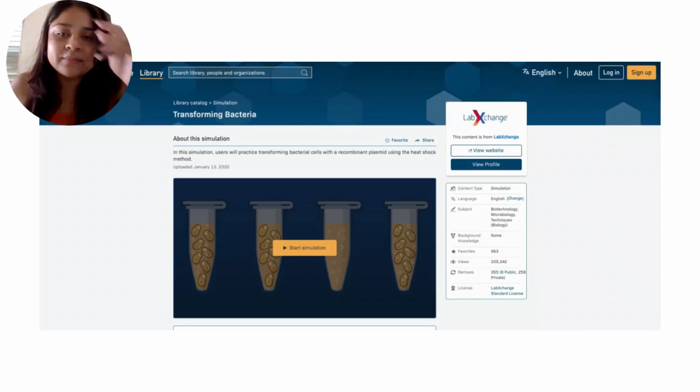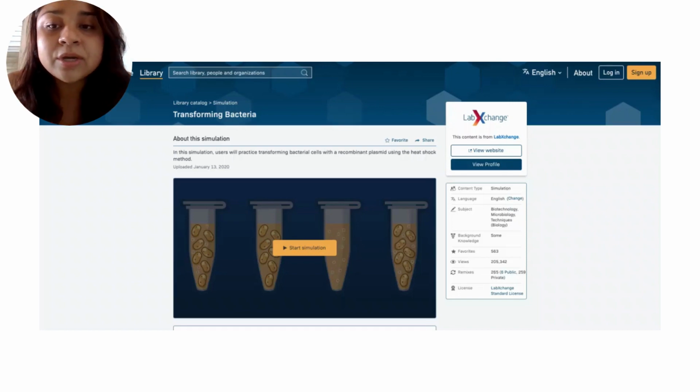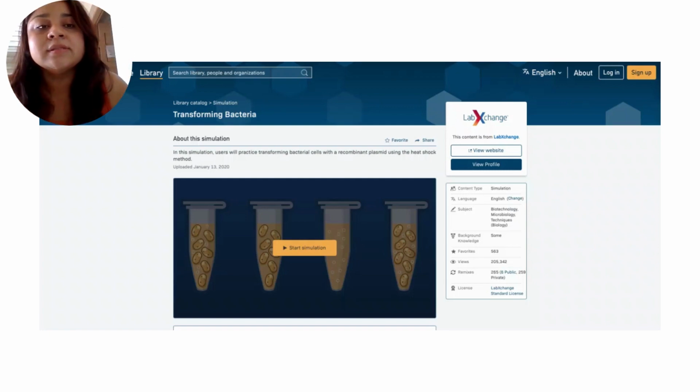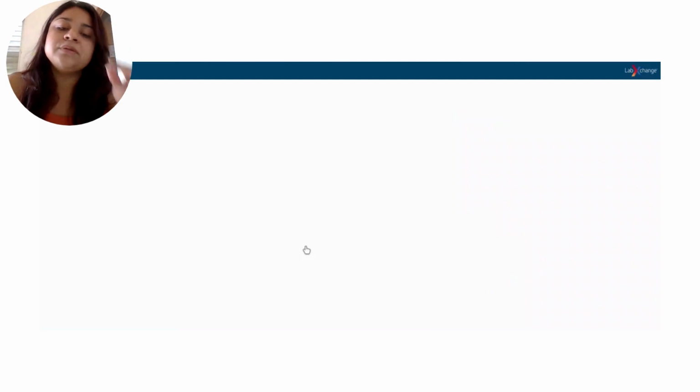Hi there, my name is Giselle Mendez and I will be starting my simulation lab. This is for the course Biochemistry and Molecular Biology. So this is my attempt. Start simulation.